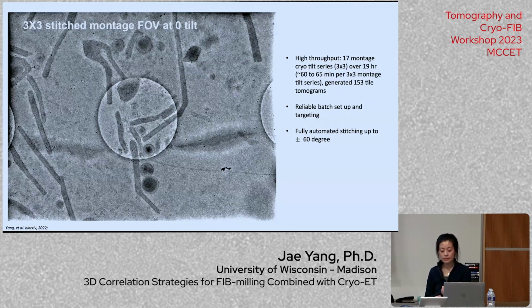And then there's another question about, do you use any pre-processing prior to doing the registration, such as tools like the LaserX tool? Yeah, so it depends on how noisy your image is. I guess generally people would want to know how good the registration points need to be to achieve better correlation. If that's the question, I would say the more precise, the better. But it is to a point. I think it's more important that you make sure they are corresponding, matching points, so that you don't misplace the points on the IFLM and the points on the TEM.